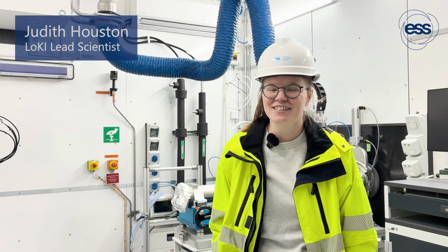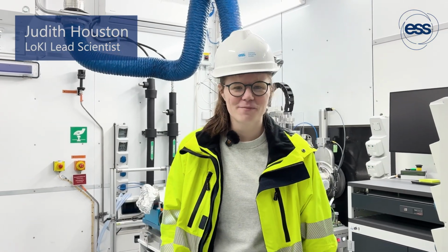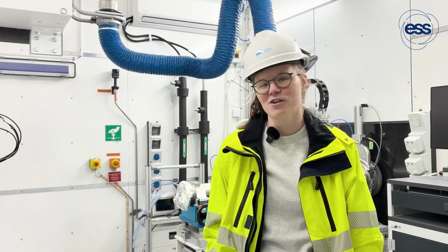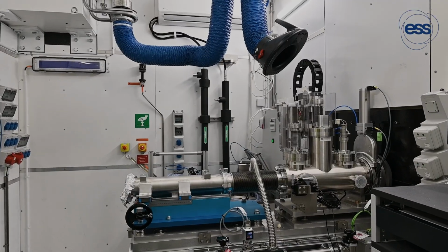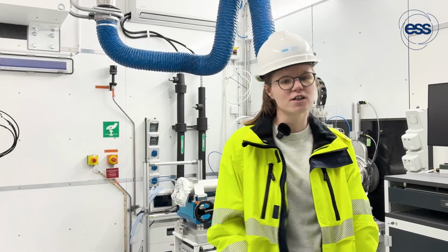I'm standing in the sample area of the LoKI instrument. LoKI was designed specifically with the soft matter, materials and bioscience scientific communities in mind. It is a small angle neutron scattering instrument. We detect scattering from samples at very small angles. Those very small angles correlate to the structure inside the sample from a nanometer to a couple of hundred nanometers.